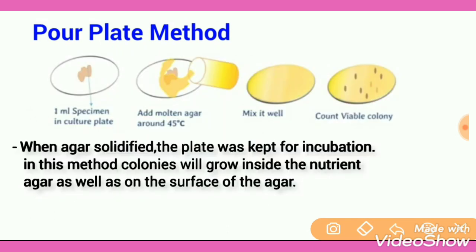When the agar solidifies, the plate is kept for incubation. In this method, the colonies will grow inside the nutrient agar as well as on the surface of the agar.